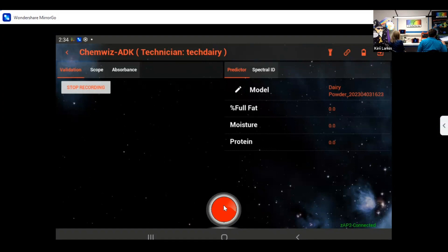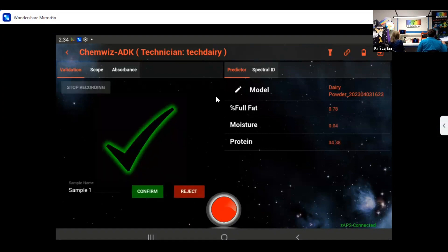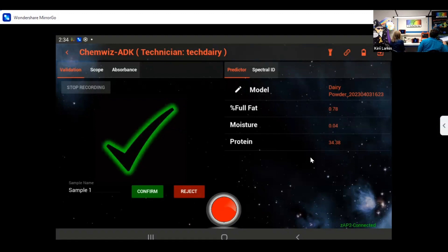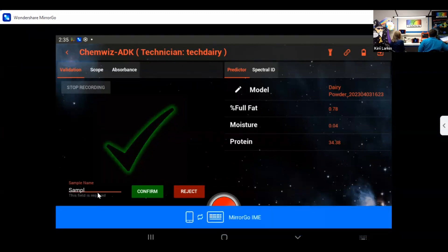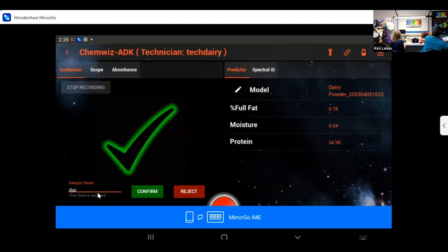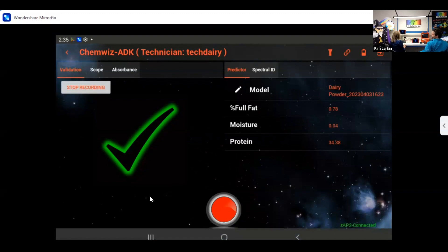Ken is going to go ahead and place the sample on the fixture. I press select and it gives a confirmation that we have a dairy sample on the fixture. It's giving us a very low fat value, which means it's probably a skim dairy — very low moisture and a high protein value, which makes sense for a skim powder that's been dried out. I'm going to go ahead and save that as 'dairy demo' and confirm it. Let's go ahead and put another sample on the fixture and measure it again.